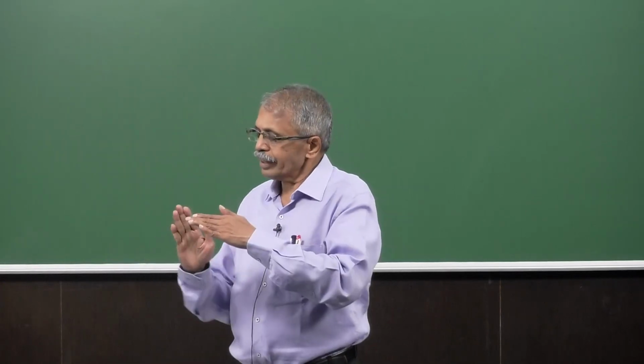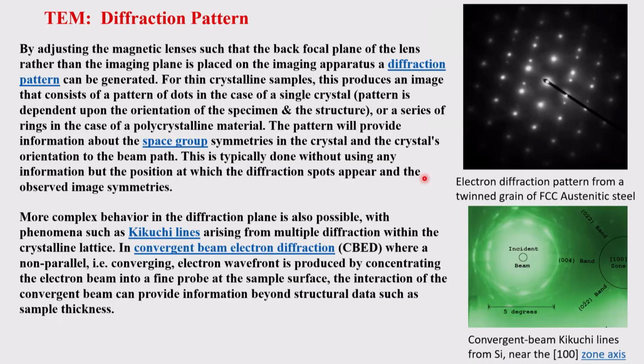Therefore as if that crystallite acts like a single crystal. Then you can tilt this particular sample, and you can get another orientation. So using several patterns of these electron diffractions, you can get crystallographic parameters, like what kind of lattice, what kind of space group, all the information you get from X-ray diffraction, you can also get from here. So the TEM machine is a little modified kind of thing. So diffraction patterns, space groups, all the crystallographic parameters you can get.